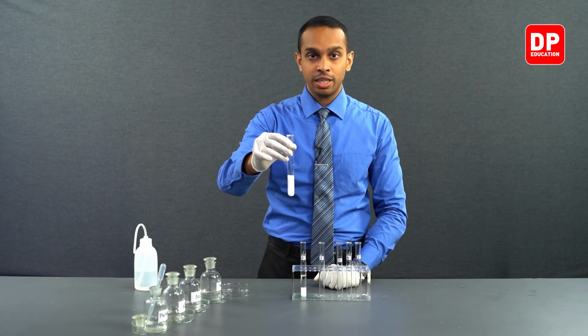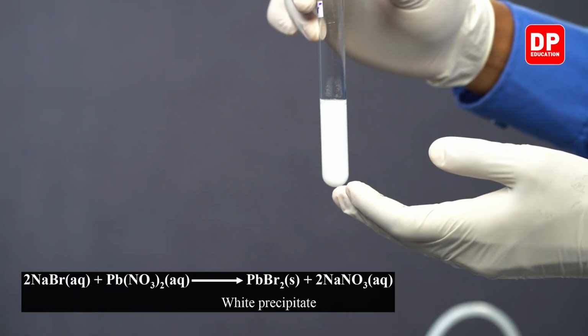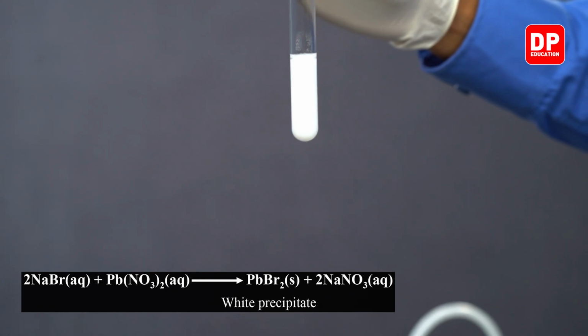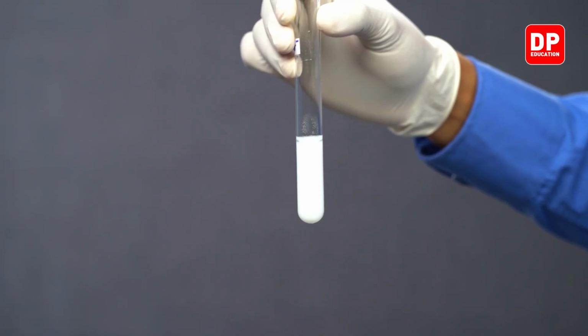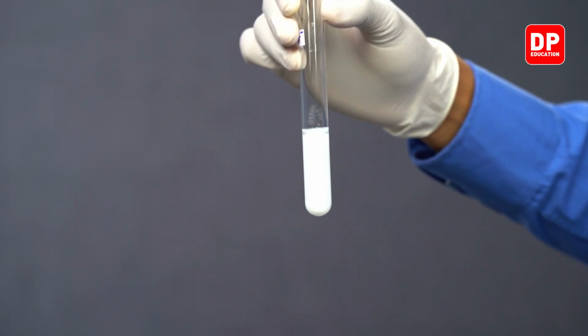As soon as you added lead nitrate, you could see the formation of lead bromide. PbBr2 is the formula, and it is a white color precipitate. Both lead chloride and lead bromide happen to be white color precipitates.